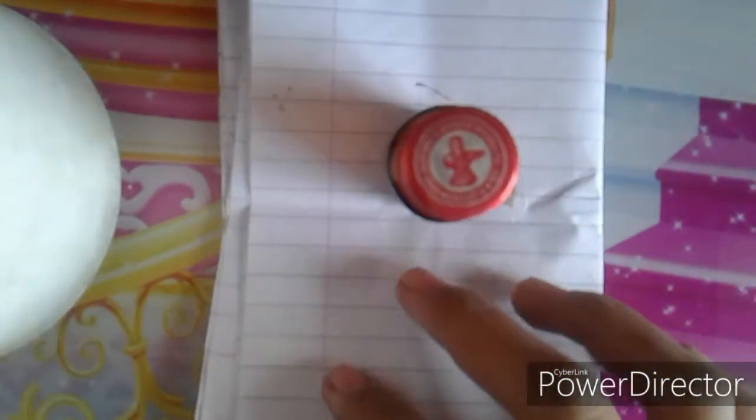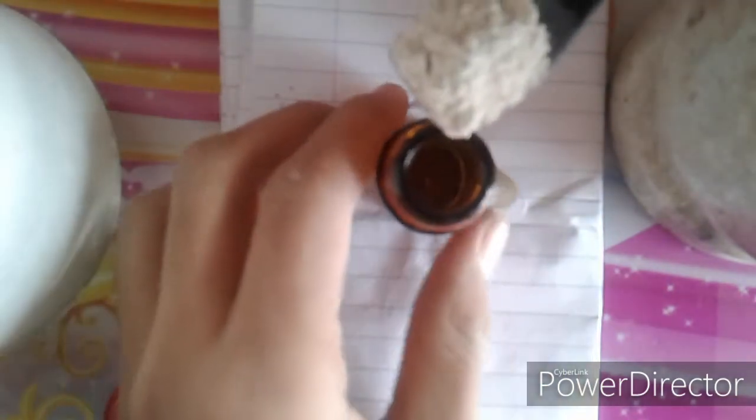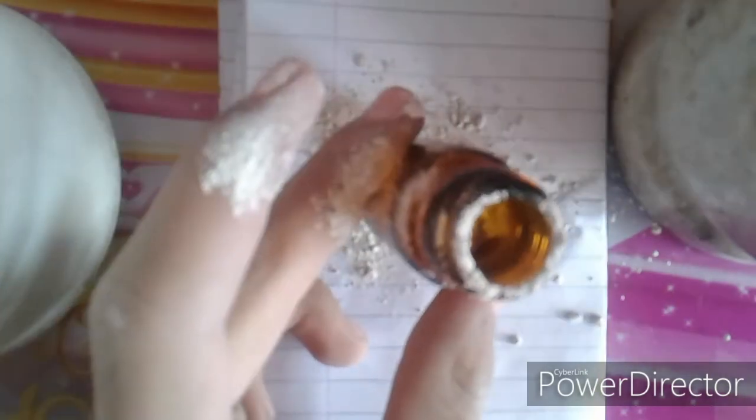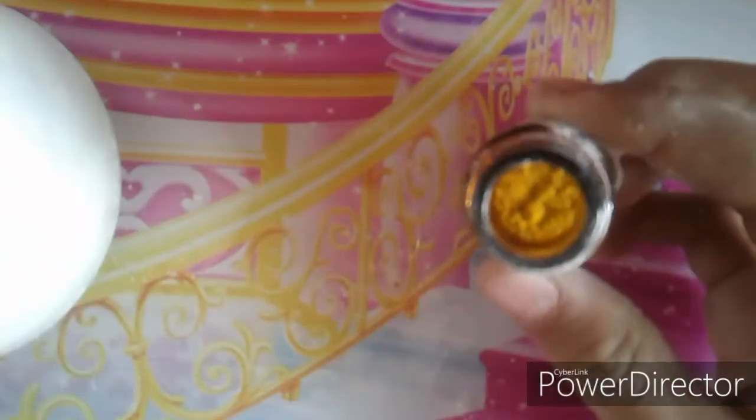Now take a container to store the calcium sulphate. Open its cap and simply add the powder into it. This fine powder is our calcium sulphate — that was an easy method to prepare and store it.